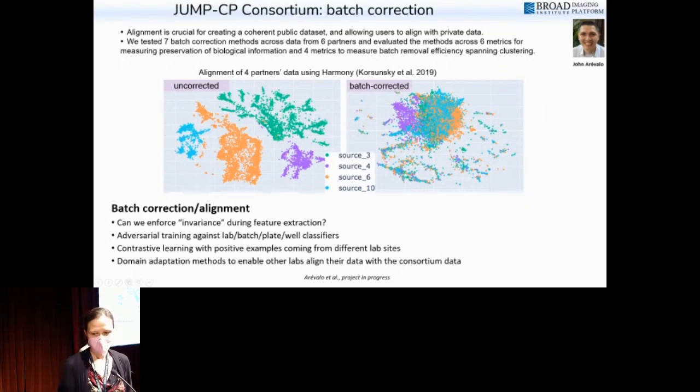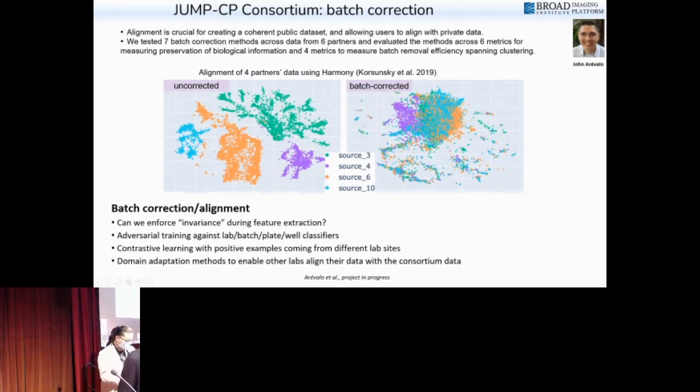And maybe a related question, since you mentioned the timing of the sample on the microscope may be important. Is it also degrading the sample in any way? Is it a concern at all for generating your data? Sorry, what is degrading the sample? How much time the sample spends under the microscope? Oh, no, it doesn't. Actually, for the cell painting assay, the samples are fixed, so it's very much not a concern. Oh, I see. Thank you for clarifying.